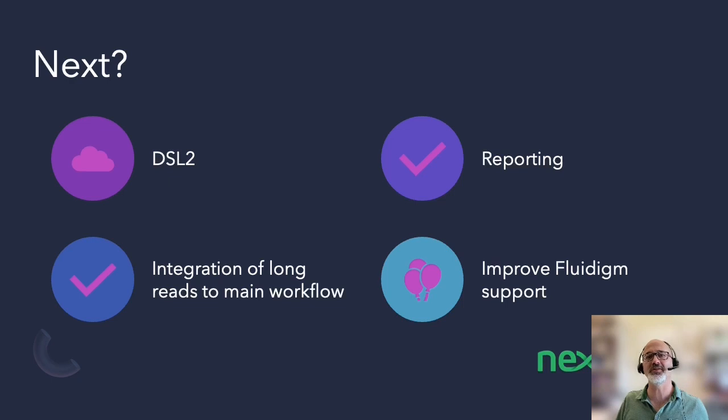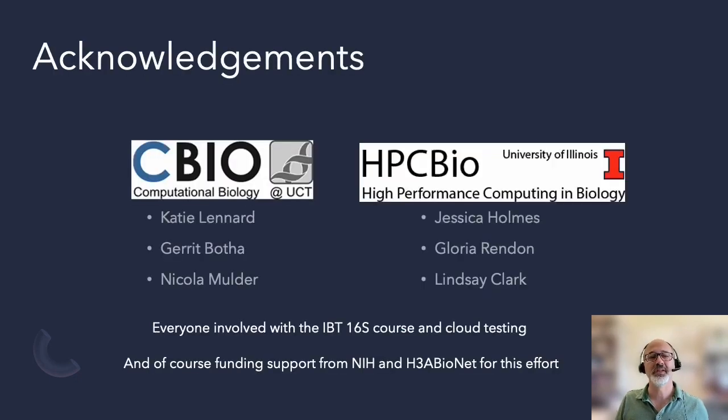So next we want to do DSL2, add additional reporting, and integrate the long reads, which are separate workflows currently. We want to integrate those into the main workflow, which we've been slowly adding over time, and then improve the Fluidigm support as well.